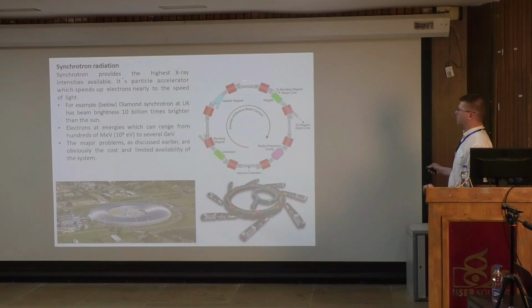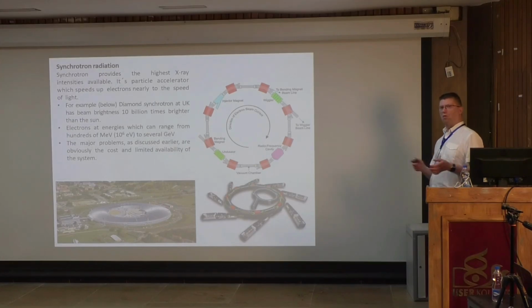And the point now is that only one of these stations, they call them stations, could be for single crystal X-ray diffraction. You can use many other techniques in here. So when we buy an instrument, it's only making the X-rays, and we can use that, we call it a diffractometer. But a synchrotron can do many other things also. And typically only one beam line is dedicated to this kind of a thing. So you can see here now, each of the stations is doing a different thing. And one of them could be dedicated to protein, for example, protein crystallography.